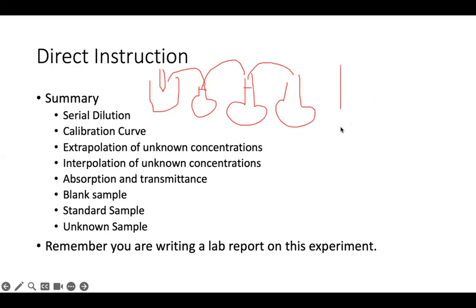Our calibration curve was our graph. We plotted absorbance versus concentration. And that allowed us to generate a line of best fit that we can then use to find our unknown solutions using their absorbance.